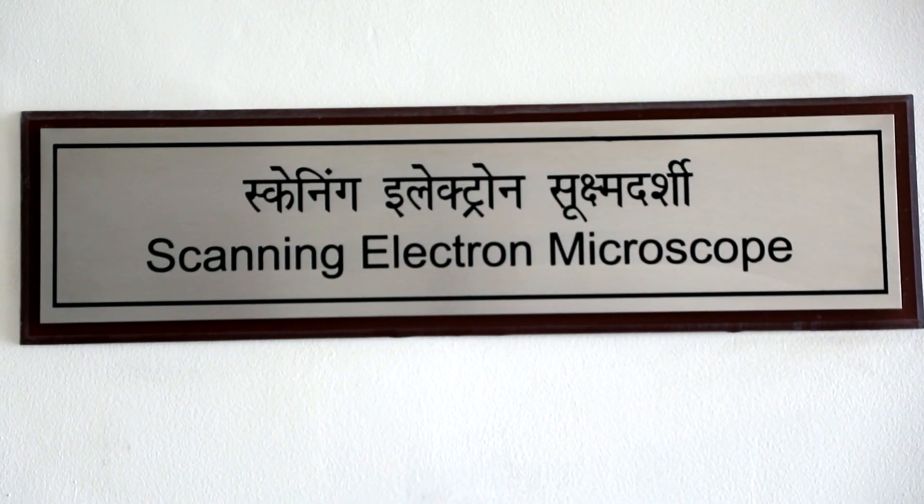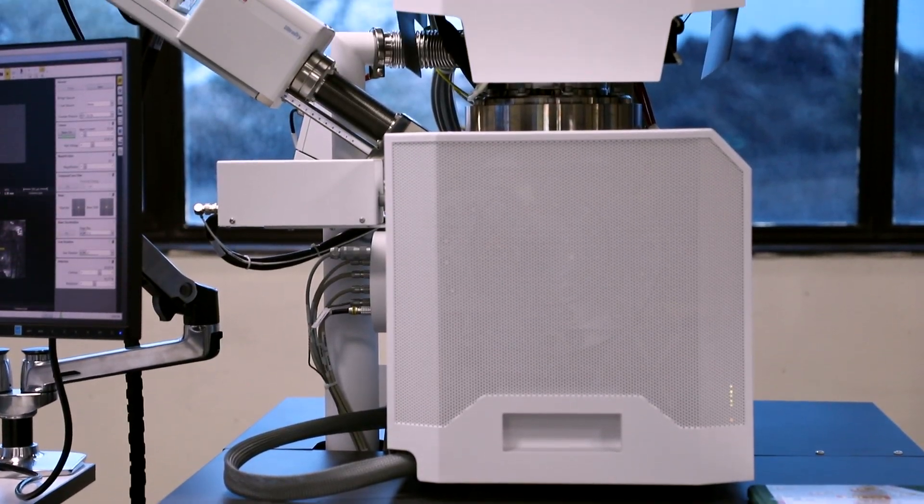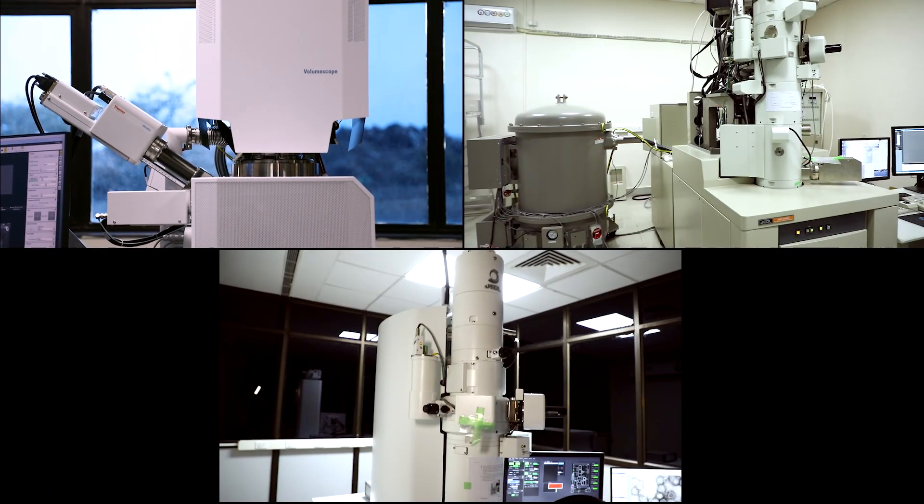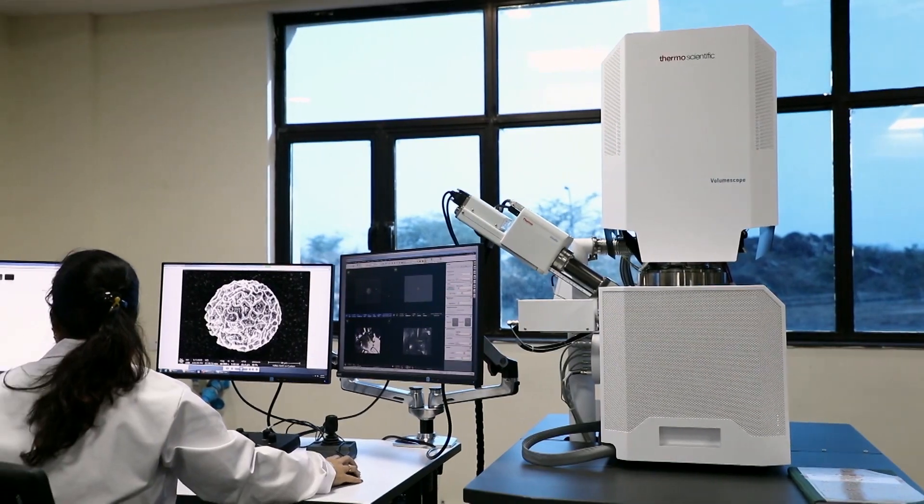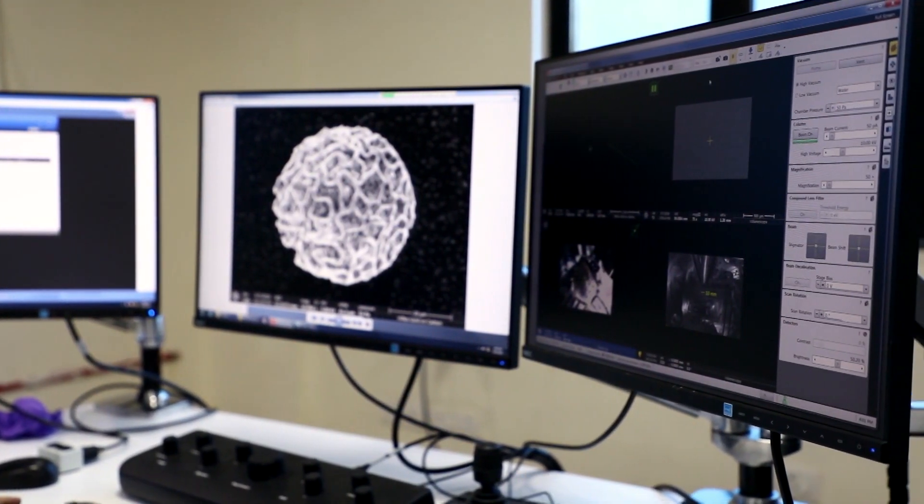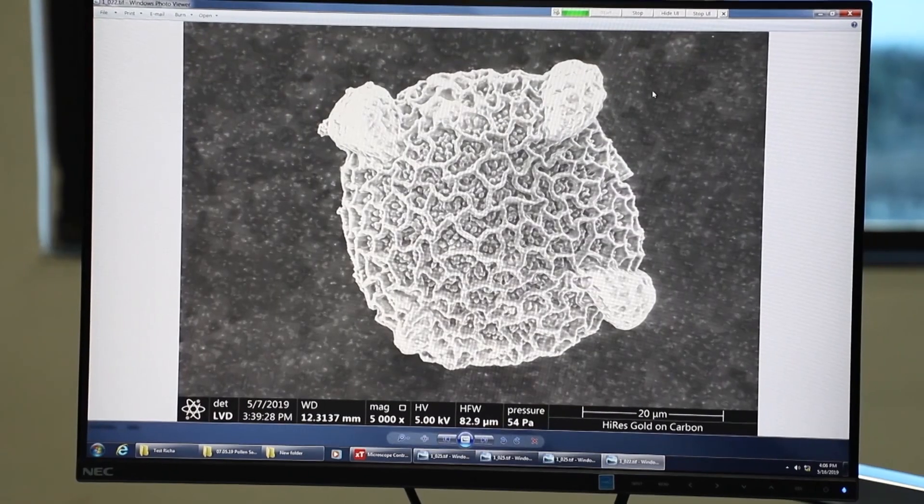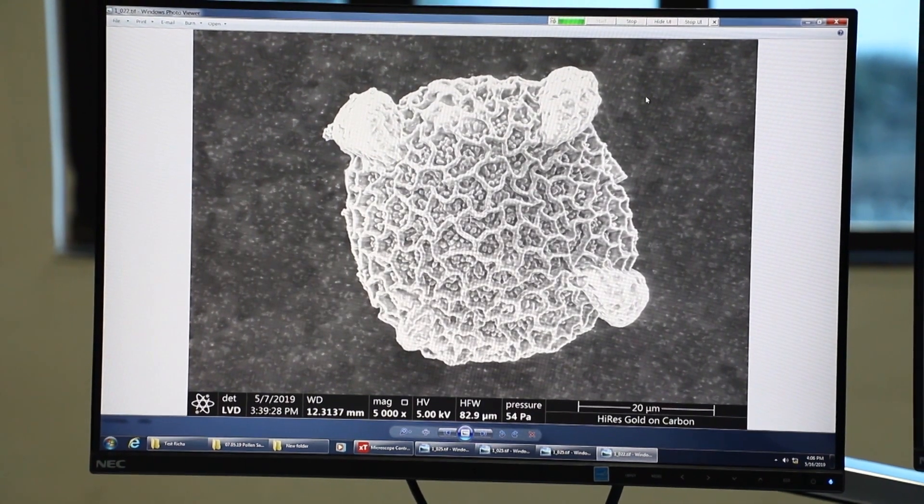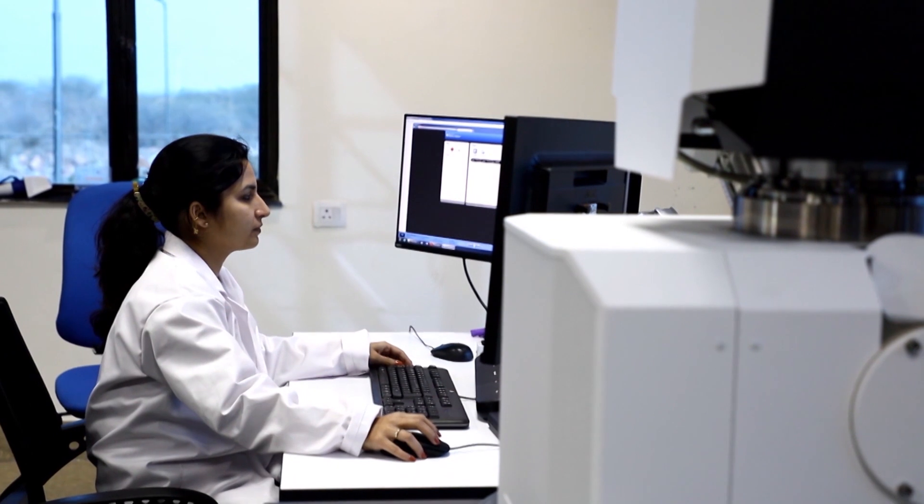Moving on, Electron Microscopy Facility houses instruments with high performance, excellent imaging and analytical capabilities achieving ultra-high resolution and ultra-high magnifications for life sciences samples.